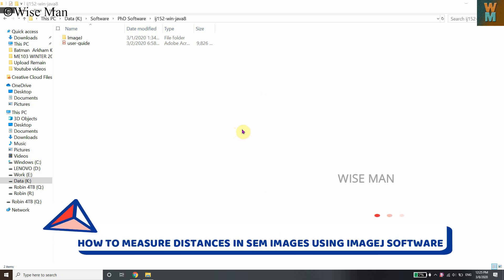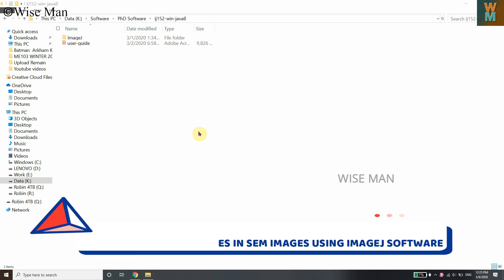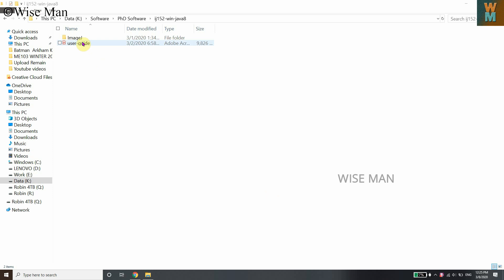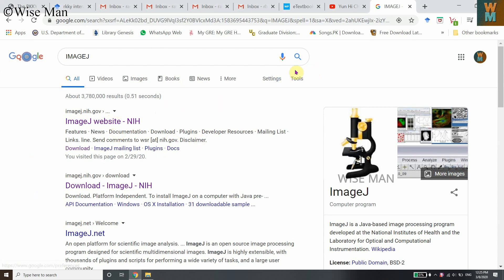Hey guys, in this video I'm going to show you how you can use ImageJ, which is a free software generally used to measure distances and edit images for research papers. We're going to see how to use ImageJ to measure the distances of an SEM image.